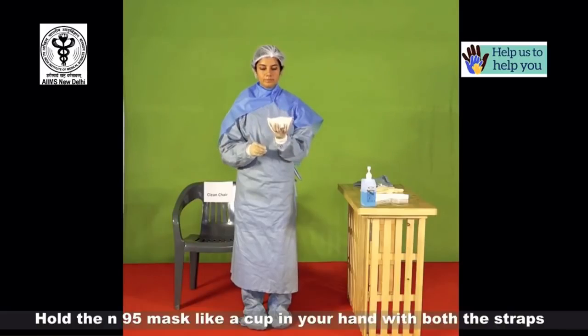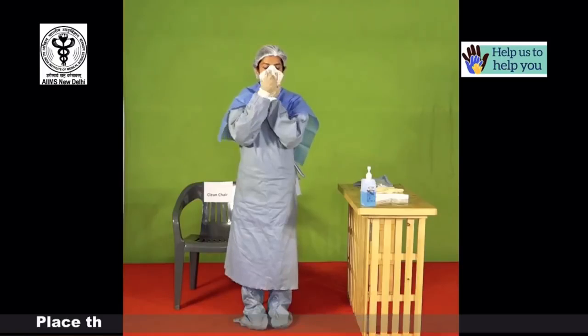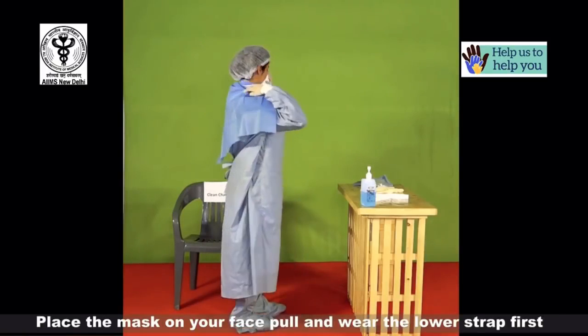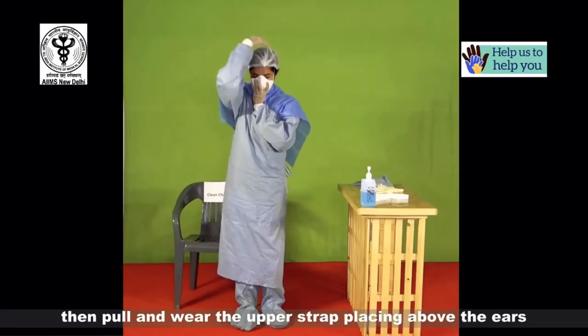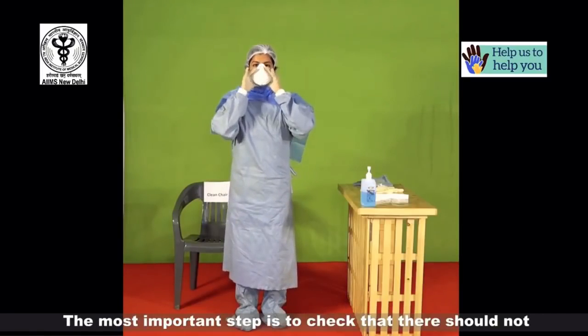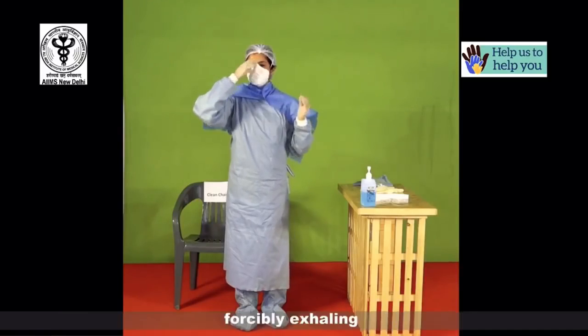Hold the N95 mask like a cup in your hand with both the straps hanging out in the front. Place the mask on your face; pull and wear the lower strap first, placing it below your ears, then pull and wear the upper strap placing it above the ears. The most important step is to check that there should not be more than minimal air leakage around the mask when forcibly exhaling.